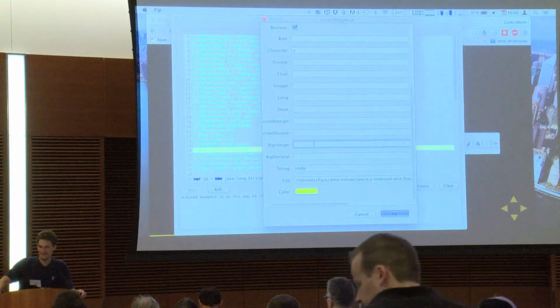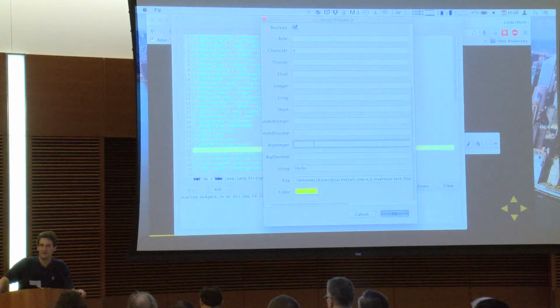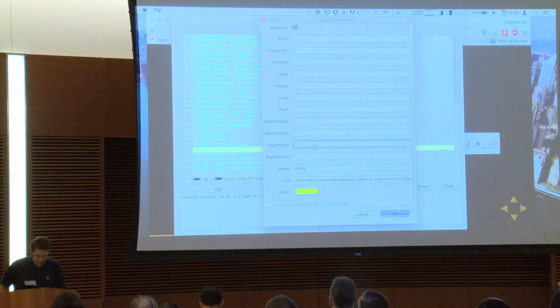The reason is you have to decide for each of your parameters, is this required? If a value is required, that's the default behavior. If you just put @ whatever, it assumes that you have to have a gamma. You can't just run this thing with no gamma. I need to know what the gamma is. But you can also put default values, and this widget thingy that you just loaded up doesn't do that. And that's the problem that some of you might be running into if you hit run.